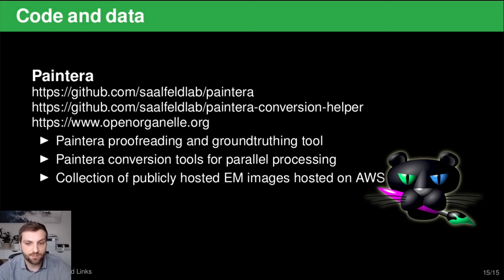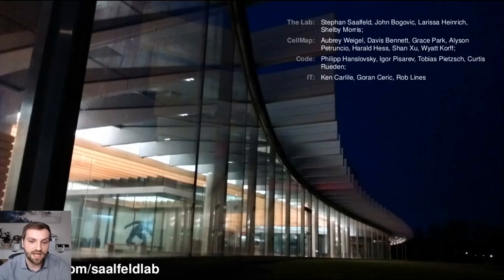Of course, Paintera is an open source project, and if anyone is interested in working with Paintera from a development perspective or has issues to report, please check out the GitHub page and feel free to reach out. As with all open source projects, Paintera benefits immensely from an engaged and active community, and I look forward to seeing more users and contributors as we continue to develop exciting features.